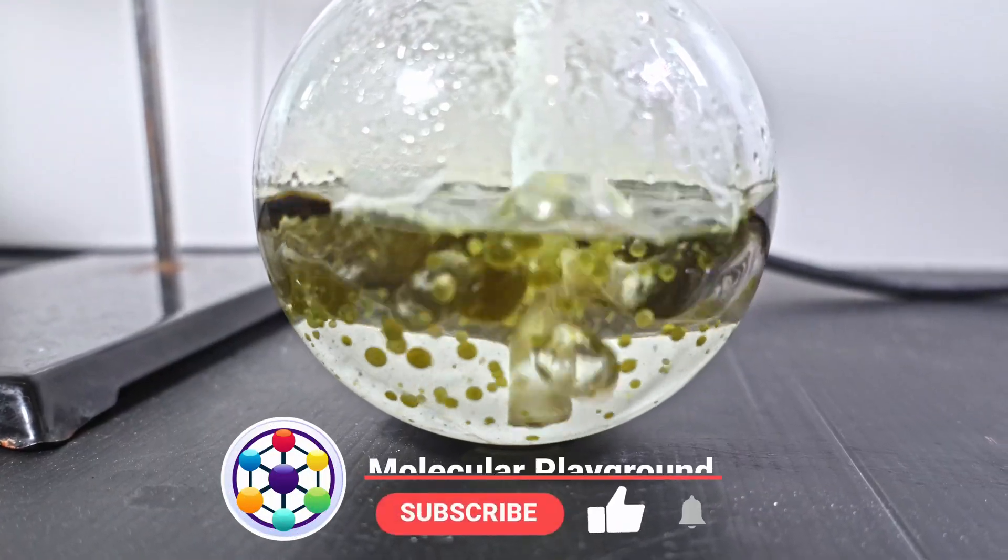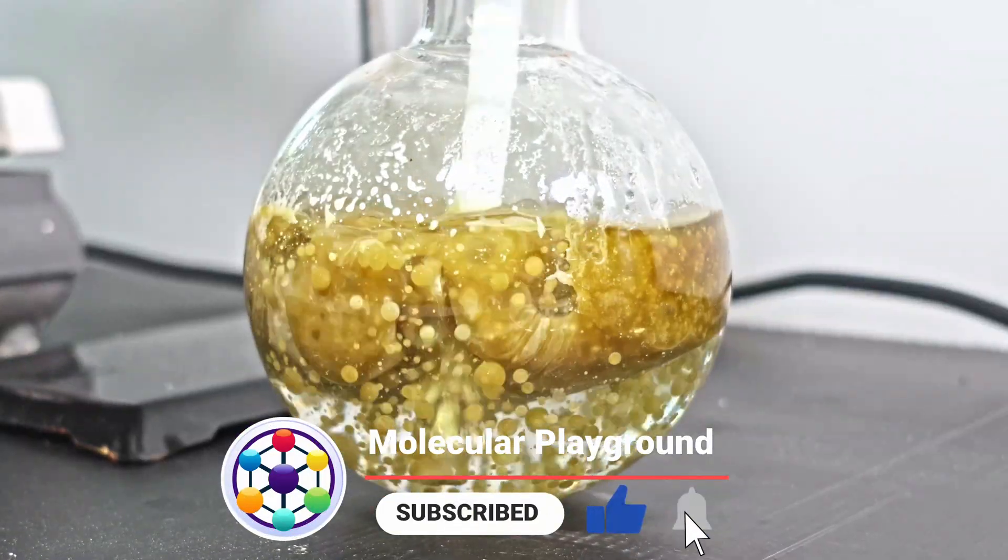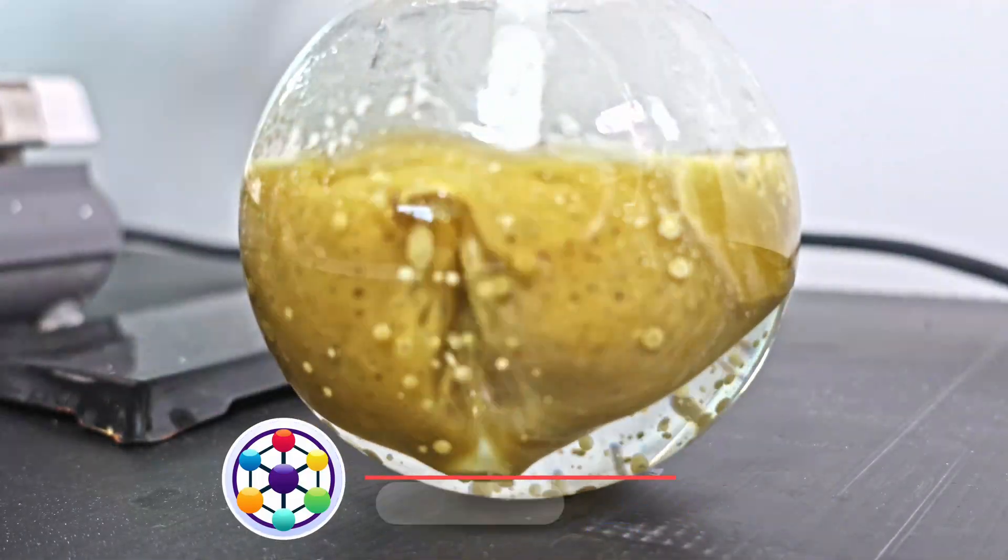Soon the hemp oil takes on a lighter green color and greater opacity. Eventually the oil becomes almost marbled and appears rather interesting.